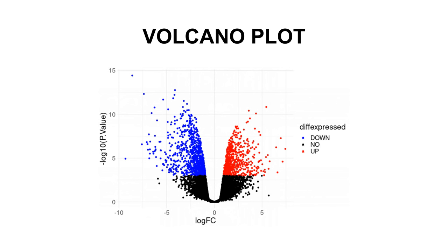That means you'll be able to identify down-regulated, up-regulated, or those genes that are not differentially expressed. This is how volcano plots can be used to visualize the data, and you can represent each of these groups using a color code. With volcano plots, the left side has the down-regulated genes and on the right side we have the up-regulated genes. The middle has those genes that are not differentially expressed. You can also add labels to genes of interest, and by the end of the tutorial, you would have generated these cool plots.